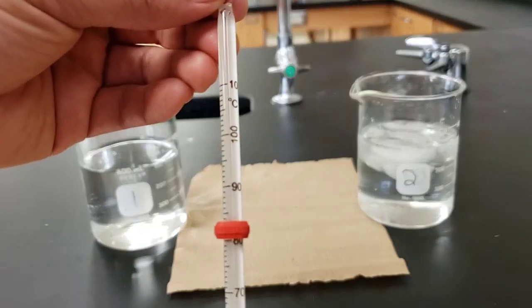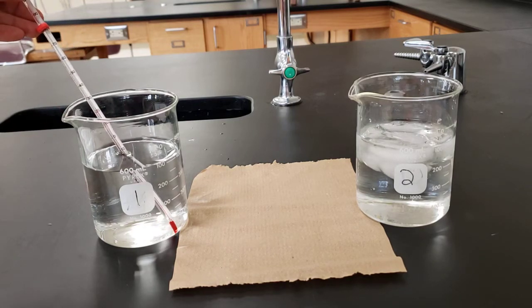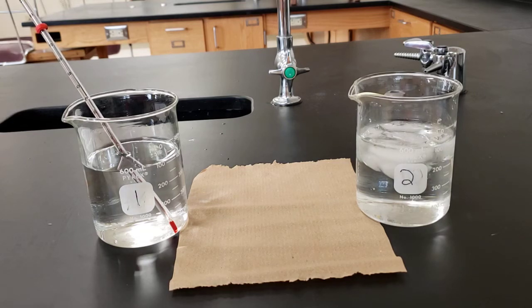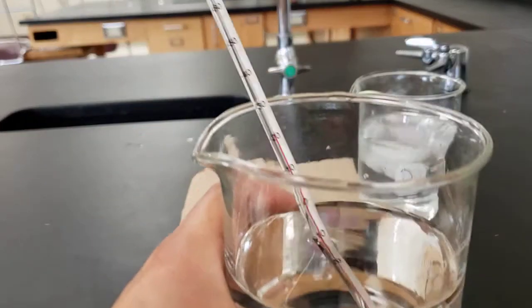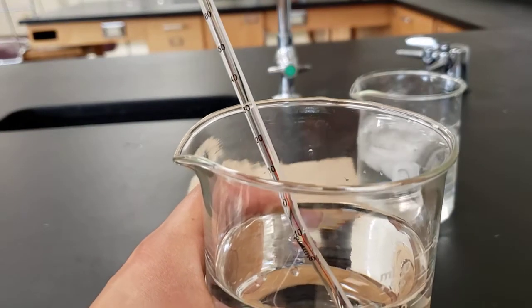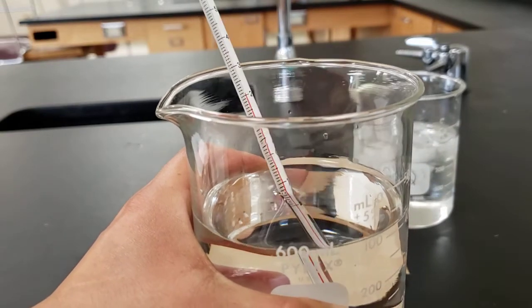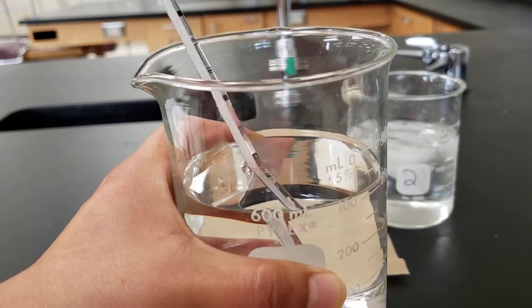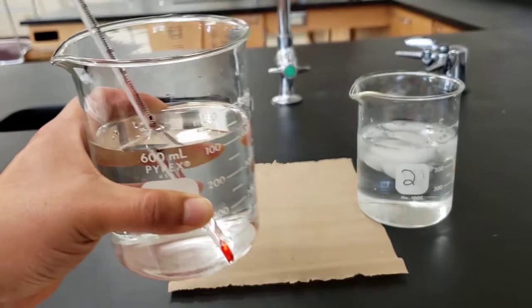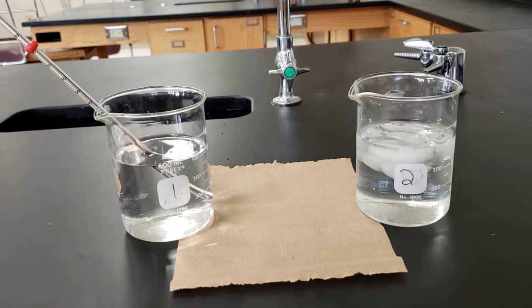According to the instructions, we're going to place the thermometer in the first beaker. We give it about 30 to 60 seconds to adjust to the temperature in the beaker. It's super important that as we put that in the water, we watch that red line, and whenever it stops changing, when it stops moving around, which is usually about 30 seconds to a minute, it should have adjusted to the temperature in the beaker, and we should be able to get a reading off of that.